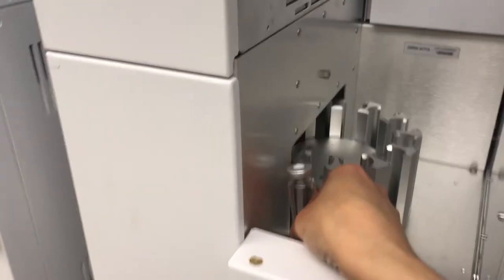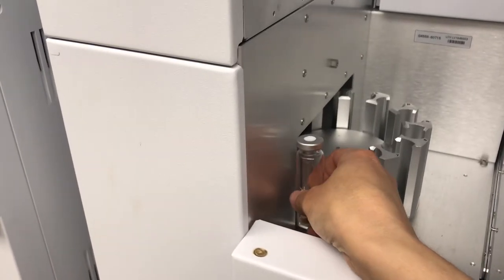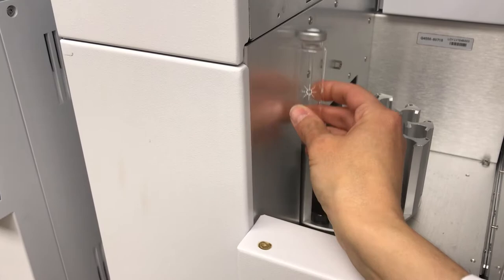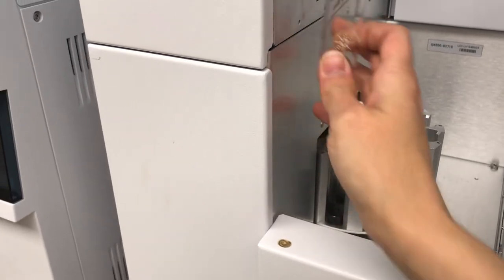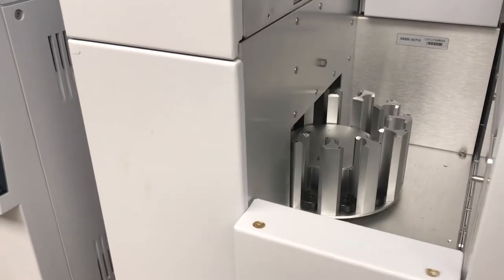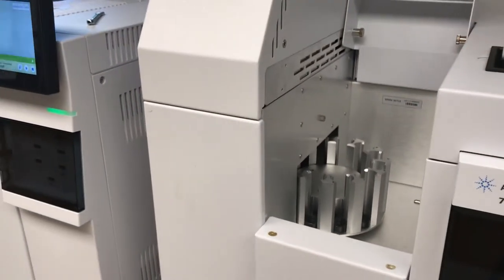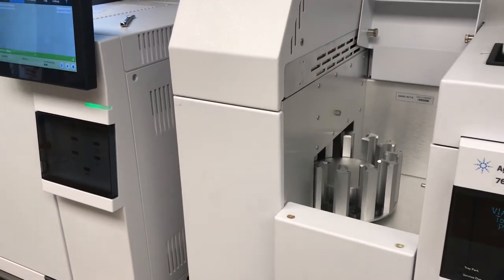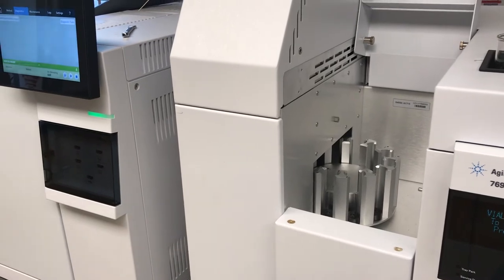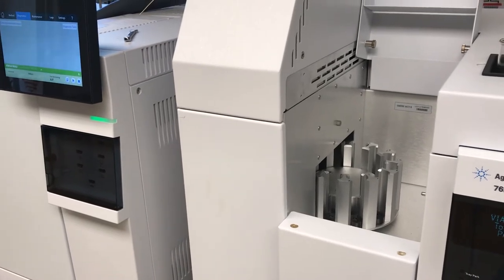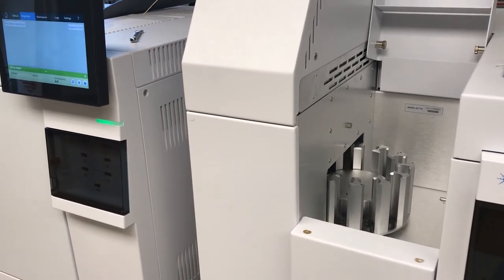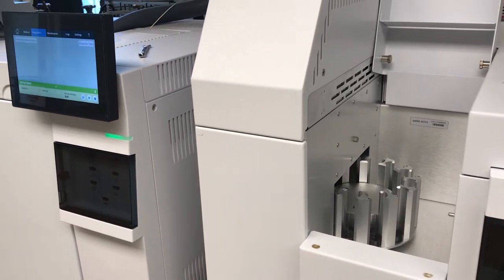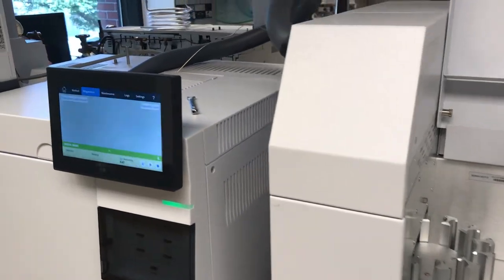What will happen is the vials will be moved from inside the carousel, pushed up inside this component here of the headspace sampler. They'll be heated to a certain temperature and then they will get transferred into the inlet.